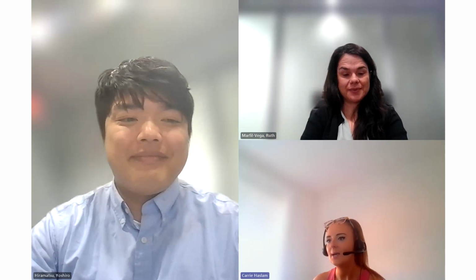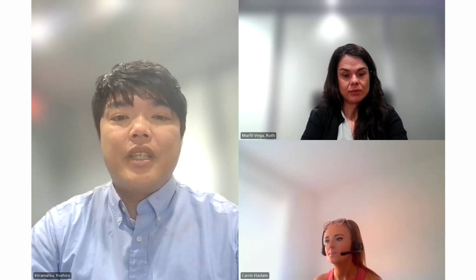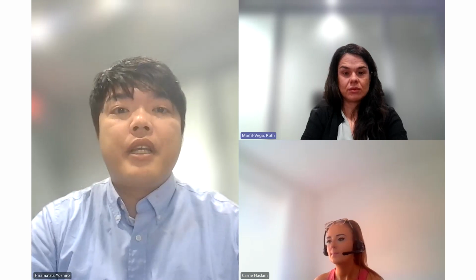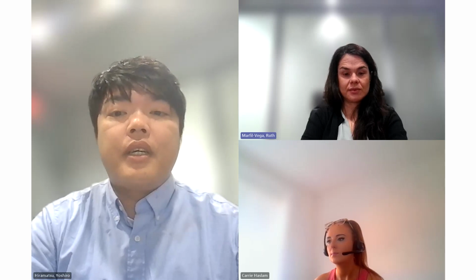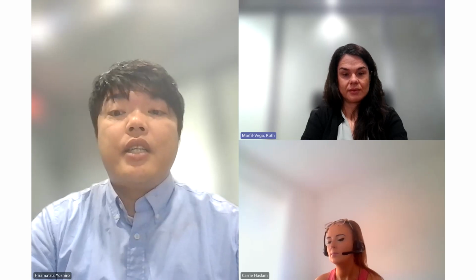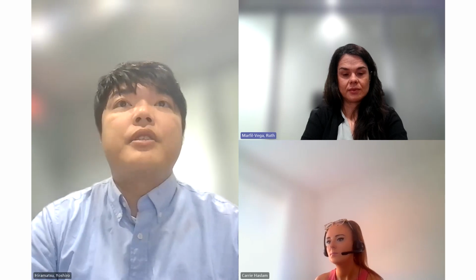Perfect, thank you. We've got another question, and this one is, can we export results from Lab Solutions as a CSV file to connect to a LIMS system? Yeah, this is a good question. I explained about reporting using our Lab Solutions Insight, but in addition to that, we can export raw data from the actual data as a text file. And also, we can export CSV format from Lab Solutions Insight as a processed data set.